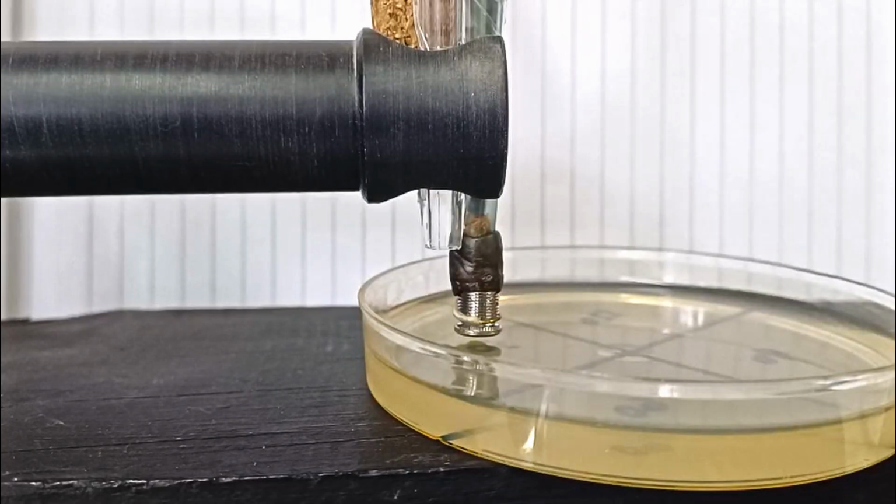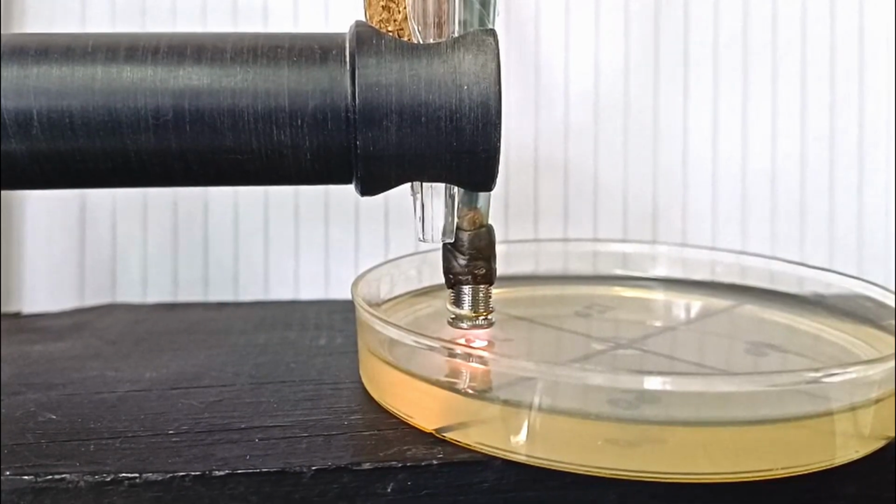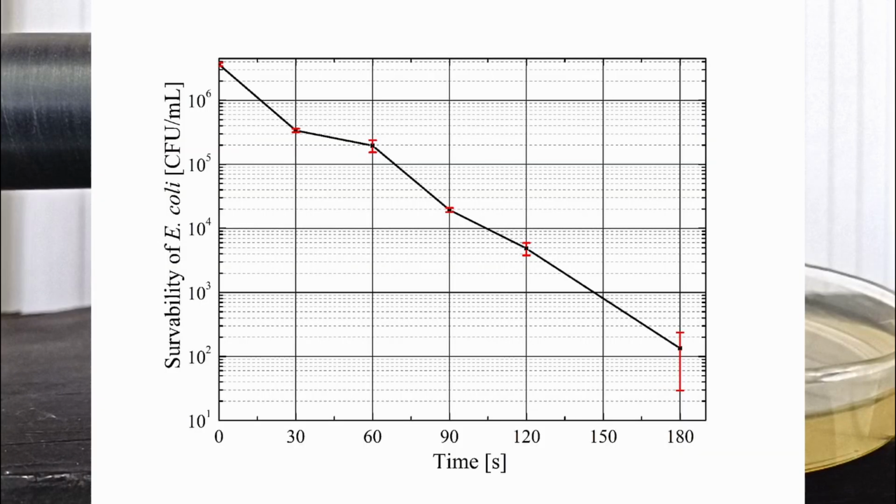The obtained results for E. coli deactivation zones can be identified on the respective agar surface as transparent semicircles of different diameters, each situated respectively at a quarter of the agar plate. The bacterial deactivation in the last two cases was effective, starting from 60 seconds of exposure time.